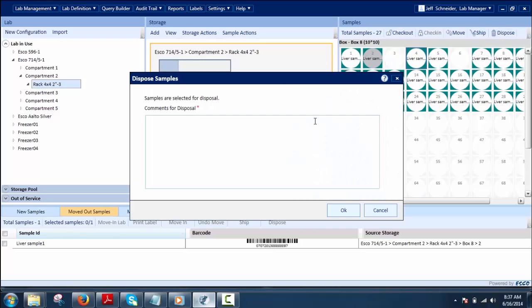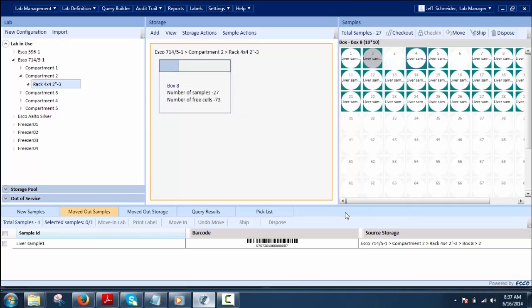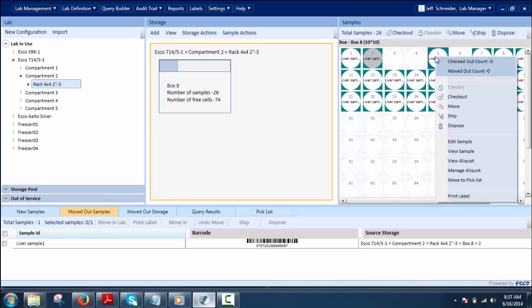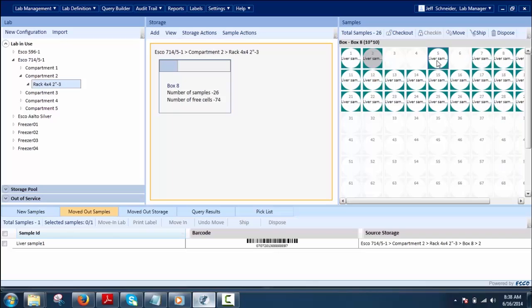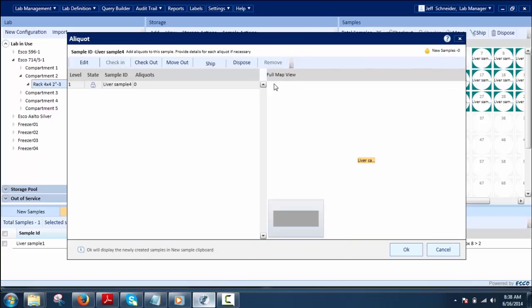Dispose deletes the selected sample from the sample clipboard. This option can be used to remove unwanted or degraded samples so that those positions are available for new samples. Lastly, Manage Alicode allows the user to create alicodes for newly created samples before checking them into the system. Using the option provided in the New Sample clipboard, only one sample can be selected at a time to create alicodes.